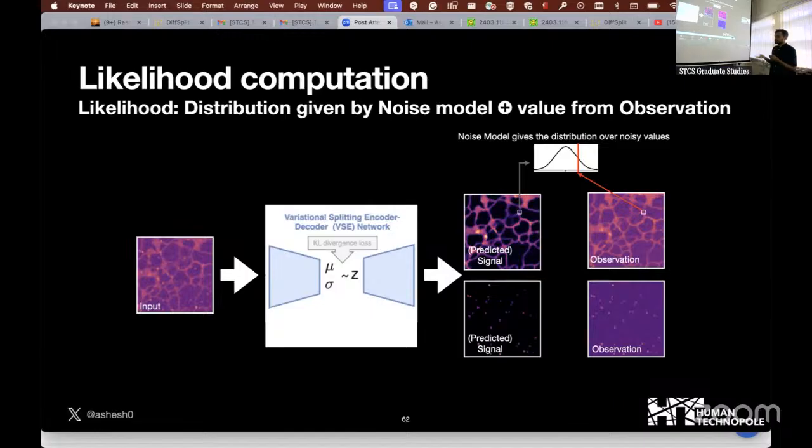The benefit of the noise model is that different microscope configurations have different amounts of noise. So if you have a noise model specific to your microscope, then we showed in our paper that it indeed gives you an additional benefit in the denoising. The noise, does it only depend on the pixel in question? We are talking about the pixel-independent noise that is present in the microscope. We are not considering here the structural noise that is also present, but that is something we are not working on.